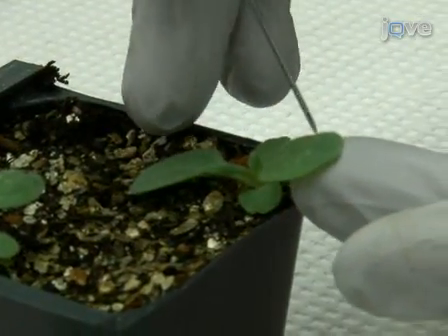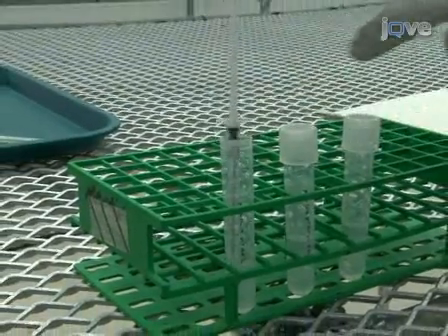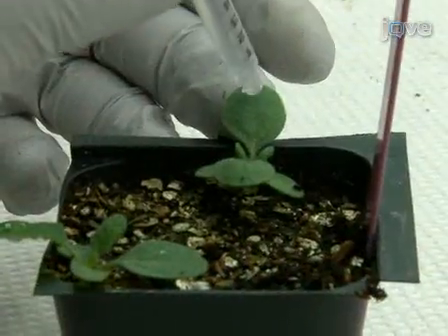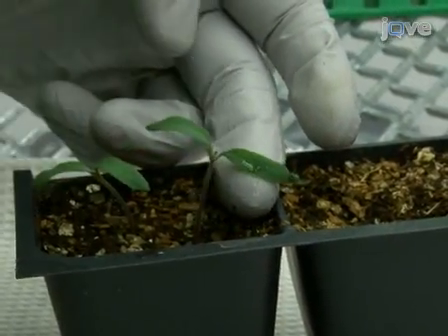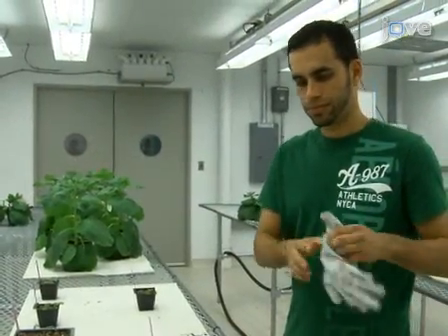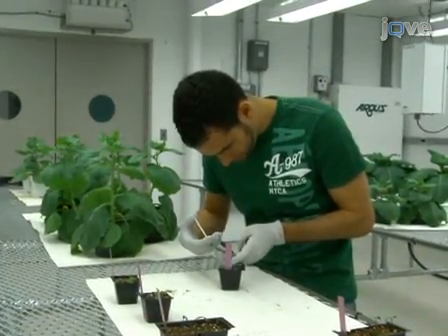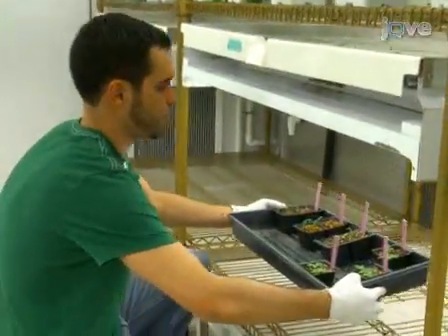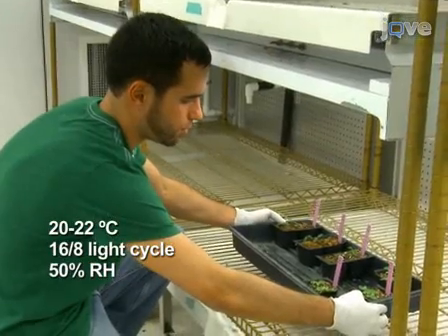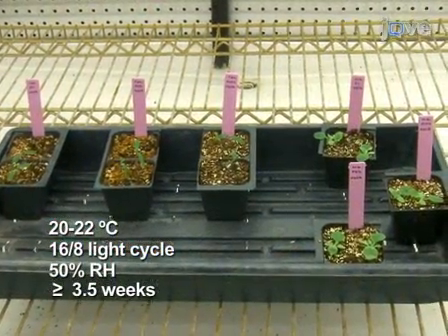Poke a hole into each leaf to be infiltrated with a needle. Use a one milliliter needleless syringe to infiltrate the bacterial suspension into the seedlings. To avoid cross-contamination, change gloves between infiltrations and do not water the plants until the day after the inoculation. After infiltration, keep the plants at 20 to 22 degrees Celsius in a growth chamber with a 16-hour day length and 50% relative humidity for at least three and a half weeks before using them for assays.